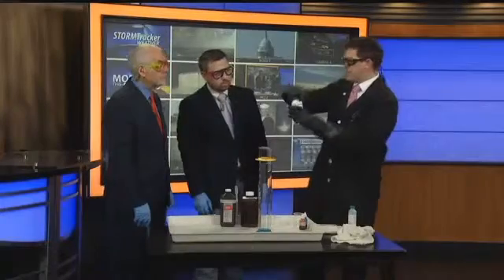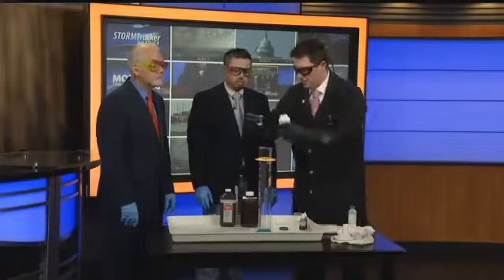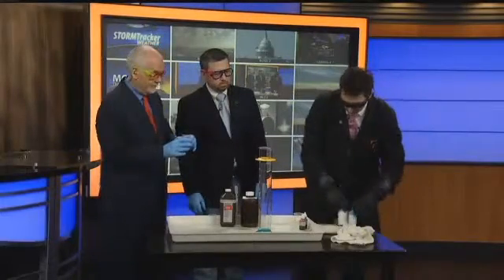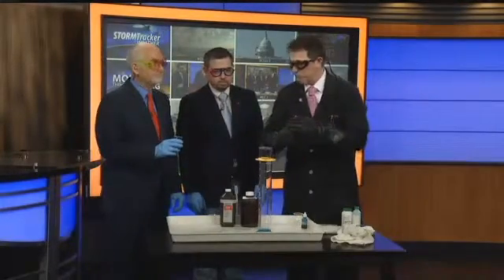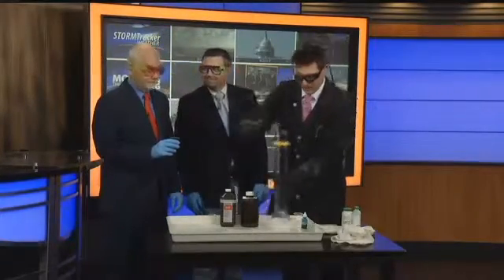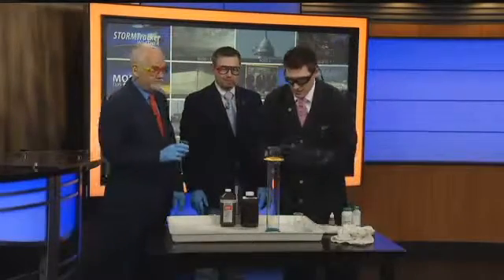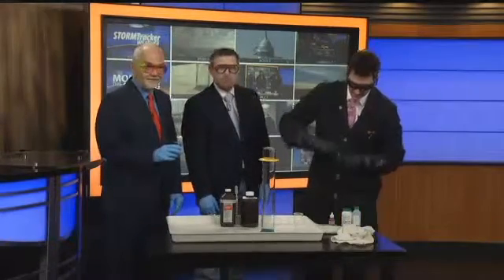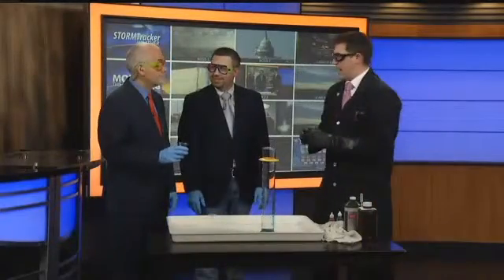We've got the potassium iodide — I'm going to put it in a little bit of water here, just dissolving it. I'm going to let you hold that, Ed, and pour it in in just a moment. This is going to bubble up and fizz and do some pretty cool things. We call it elephant toothpaste because elephants have big teeth, so they need big toothpaste. And if you're going to have toothpaste, you should have some cinnamon flavor down one side and mint on the other — so we're going to put some red in that side and blue. Then we've got the hydrogen peroxide, the good stuff, the 30%, and we're going to go ahead and add these at the same time.